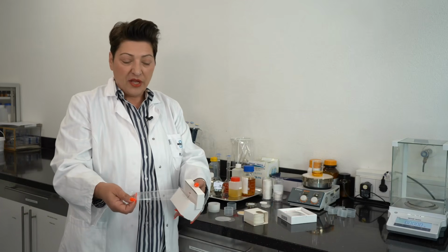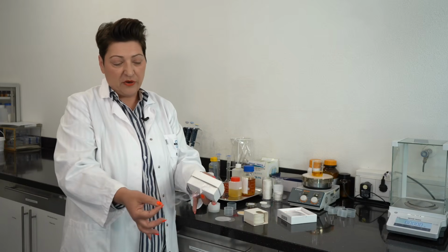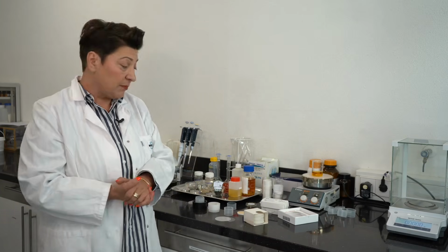And of course, maybe most of you also know these kinds of rolls which can be used. They are lower in price, but sometimes you also need more material, as this is a very thin foil, so you see it's very static. So this can also sometimes be a little bit challenging to prepare the cups, or you can buy ready-to-use cups.